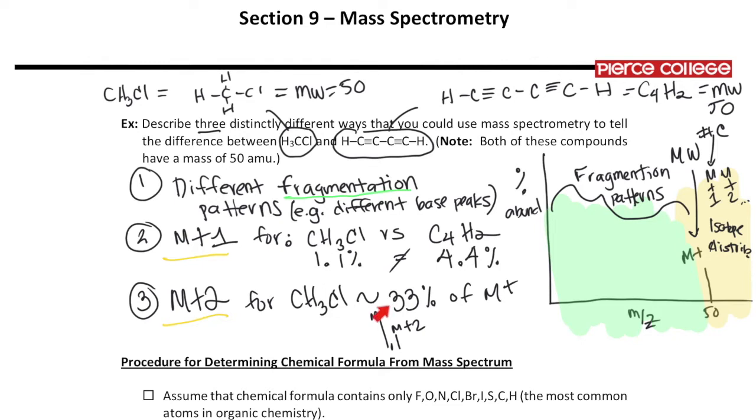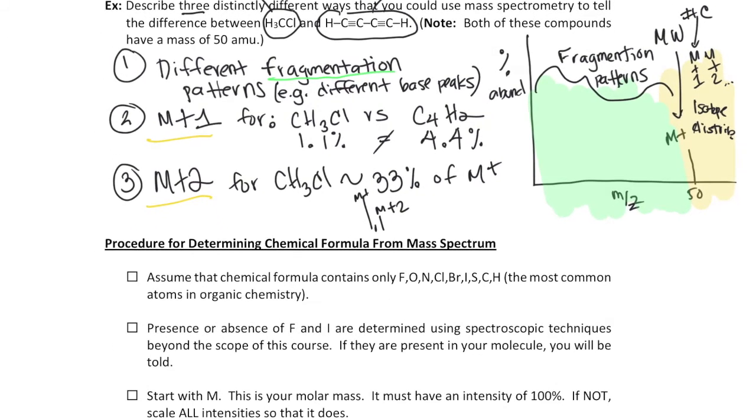So it's very useful. So here are some tips and steps to take for when you are presented with that mass spec data with all the percentages for M plus 1, M plus 2, etc. Then you take these steps to try to get the molecular formula. And that will be a big step in solving the final structure. Okay, so a few things to bring up. Here's our checklist as we go through, or just some pointers.